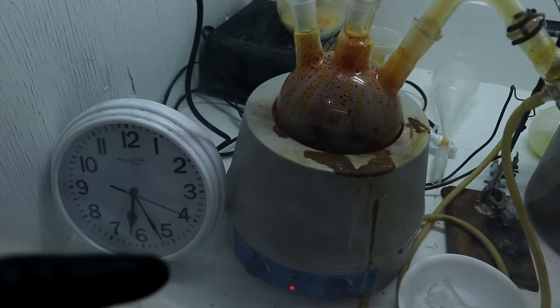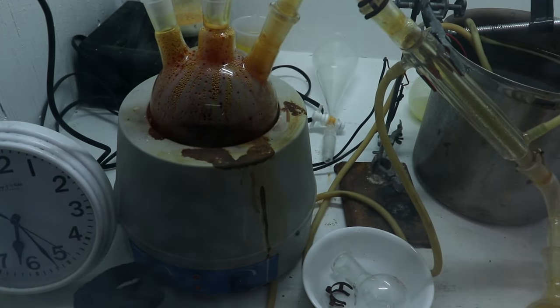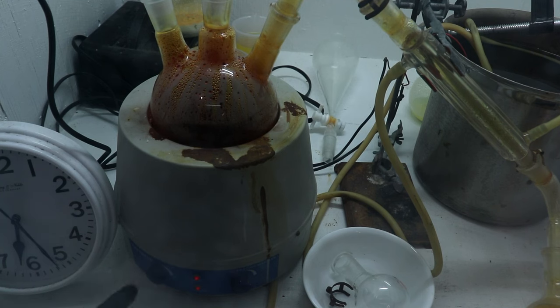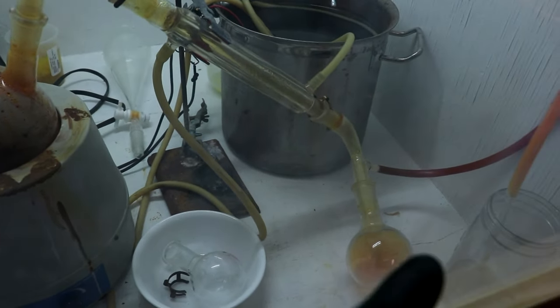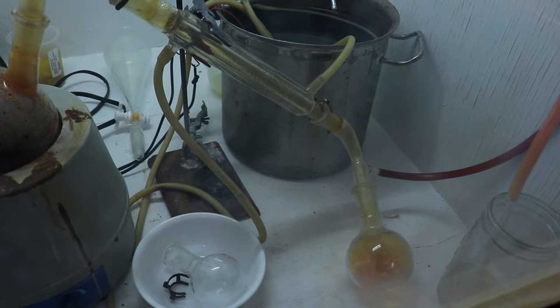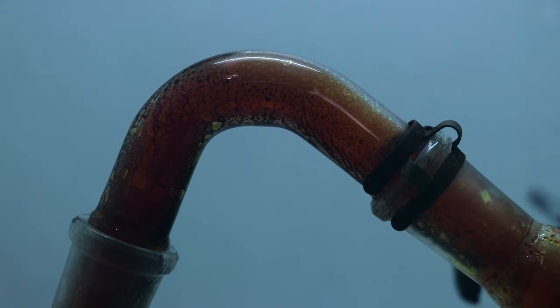So here we are after I've taken a long nap. The gold is completely dissolved. So let's turn on the heating mantle and let's drive off the rest of the bromine. We should collect the excess down in that bulb there. There it goes. The bromine's leaving.